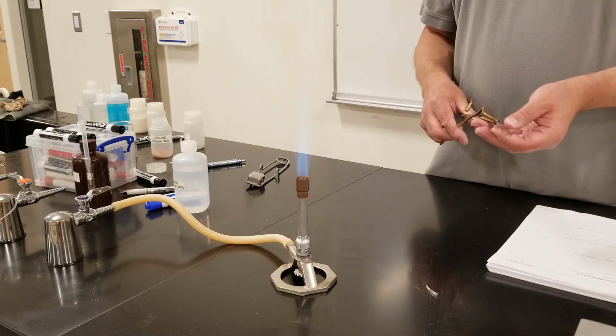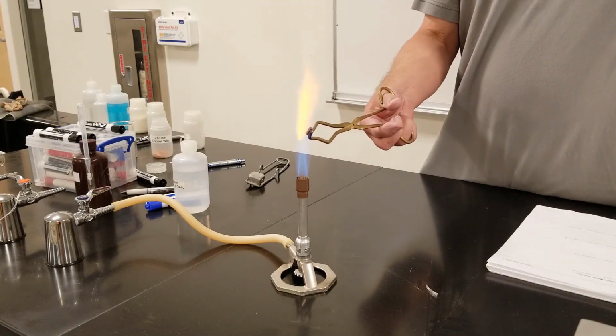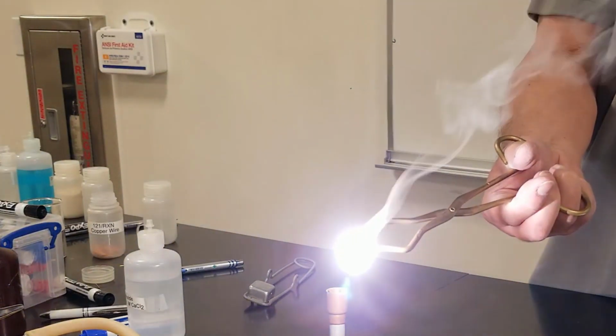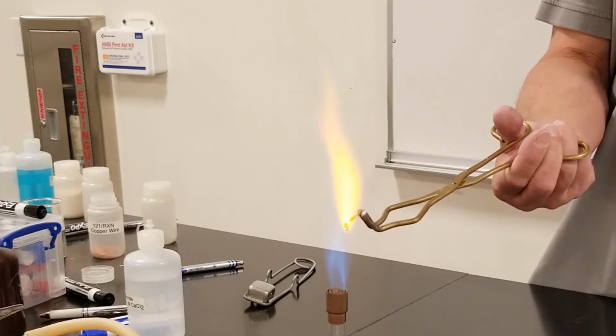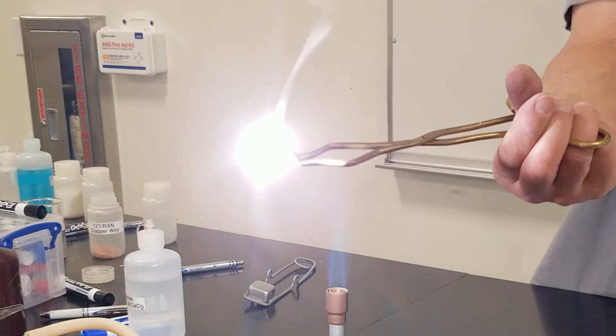Magnesium burns very hot and very bright. So here's my magnesium metal. We'll get it oxidizing with the air. And there's magnesium metal burning. Worth doing that one again. And there's magnesium metal as it's burning.